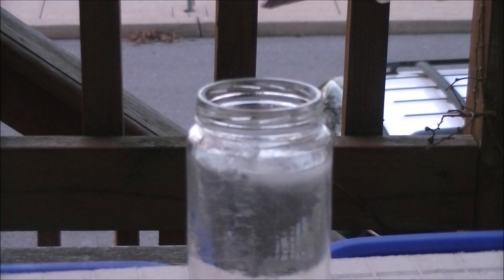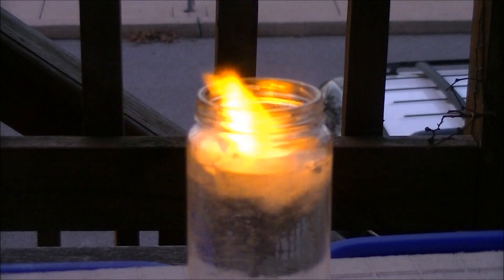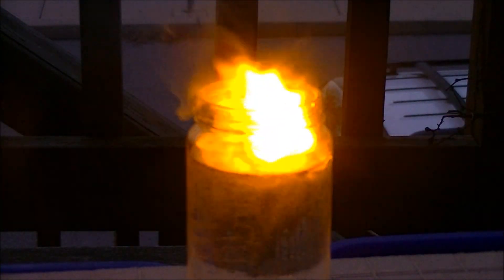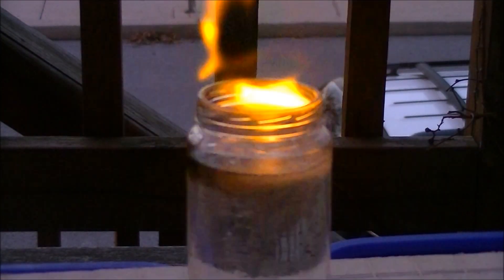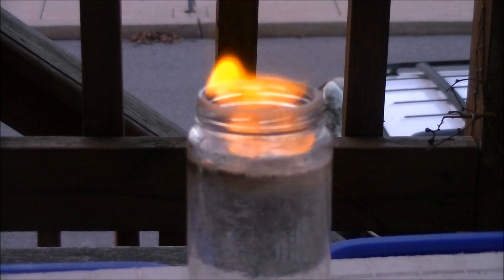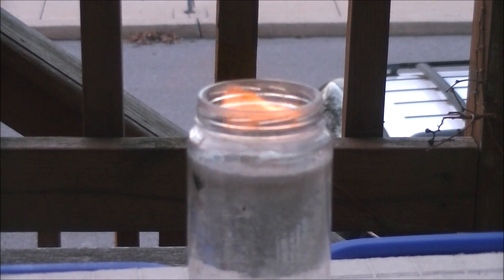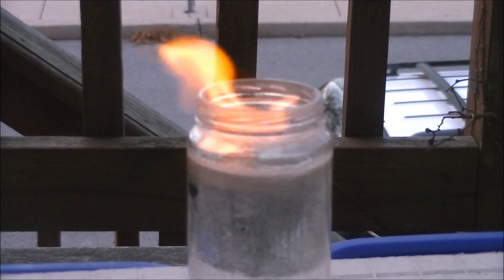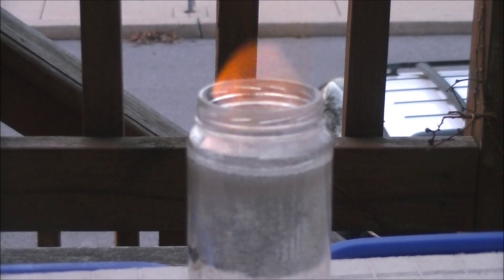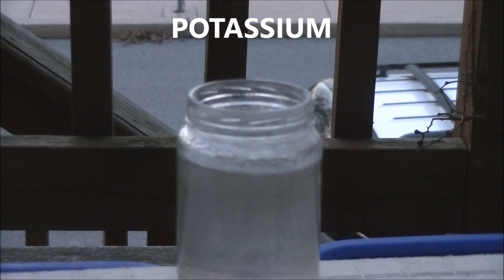Next up is sodium. Holy crap, that is amazing. Finally, here's potassium.